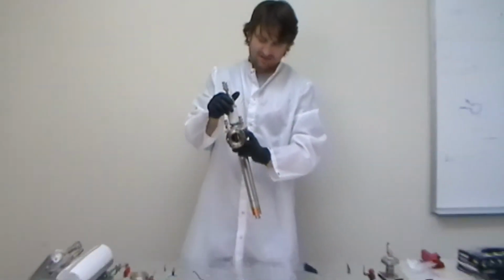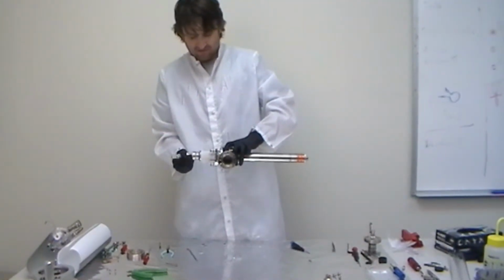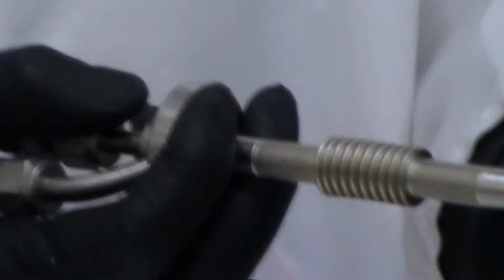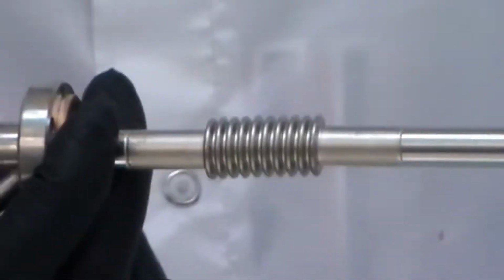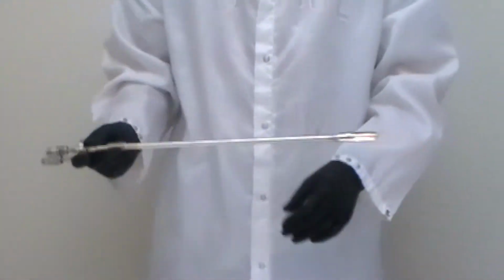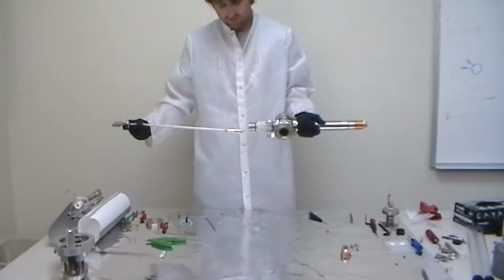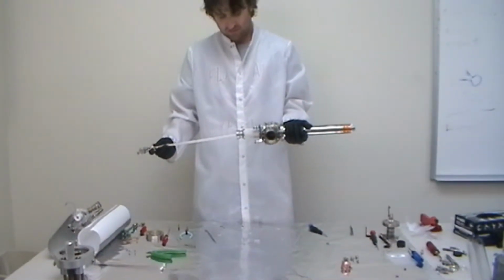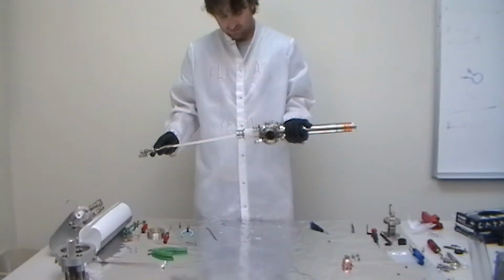And if it doesn't, what you have to do is stretch the anode slightly, as shown here. You pull it just a little bit, not very much. A little bit of a pull, and then you put it back in, and then hopefully you'll see that the anode sticks out past the football ceramic, but also that there's a little bit of spring on the anode. If you let go, it'll pop up and there'll be a little bit of a gap.